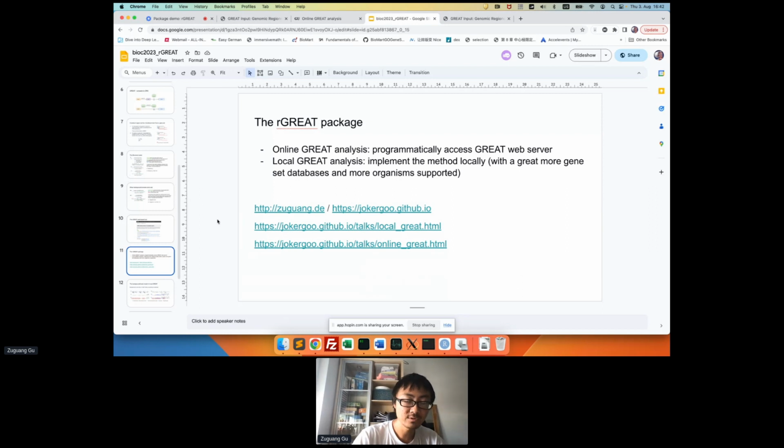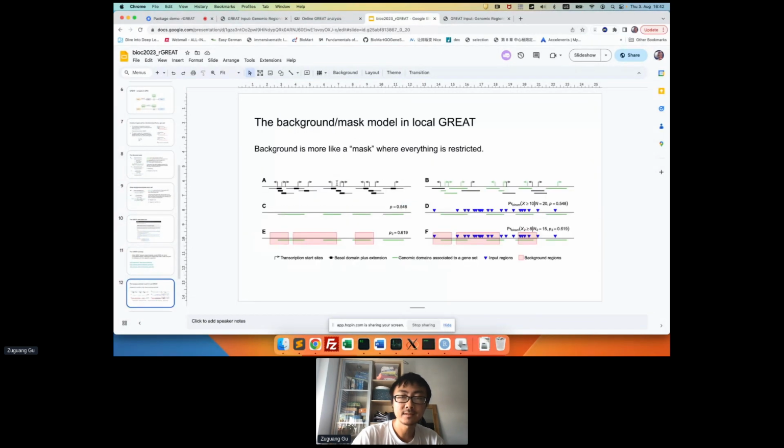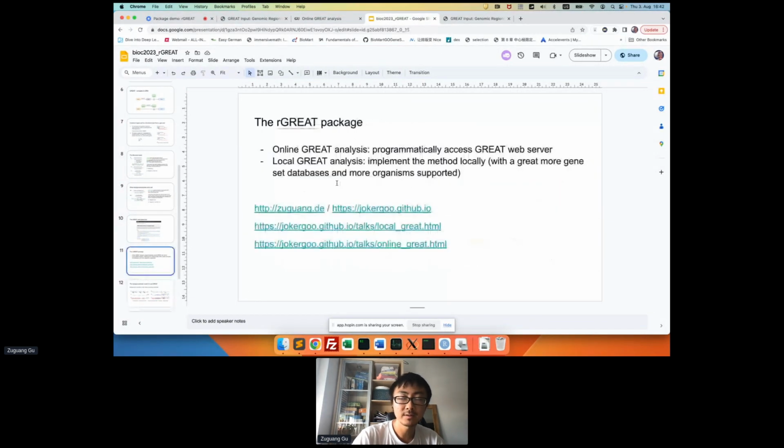I will first demonstrate the use of online GREAT analysis, and there is a Markdown rendered HTML document which you can access in this link or this link. These two are basically the same. If you want to try the code, you can type this. This is my name, zuguang.de without an s, so http://zuguang.de or https://jokergoo.github.io.